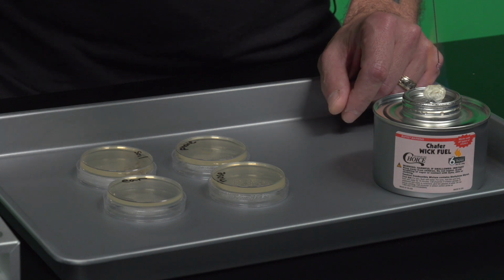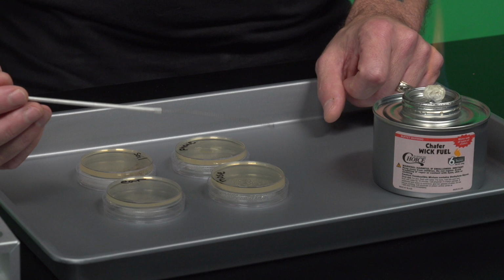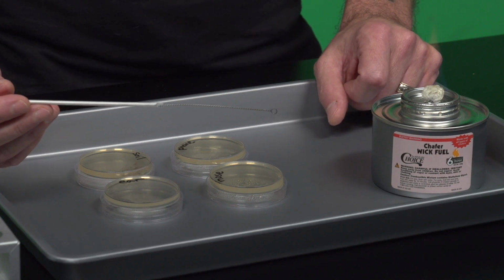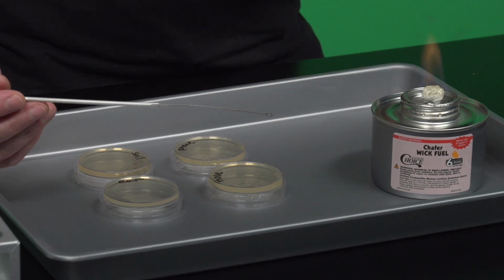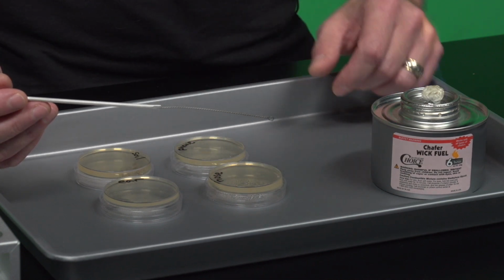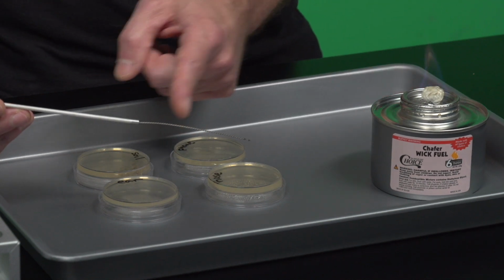Okay, so now that we've sterilized it, a very important thing to do is be patient. First of all, I'm talking to you to explain this, but you wouldn't want to be talking because right now there are microbes leaving my mouth and going all over my work area down here. Basically, we need to wait 10 to 15 seconds for this loop to cool.